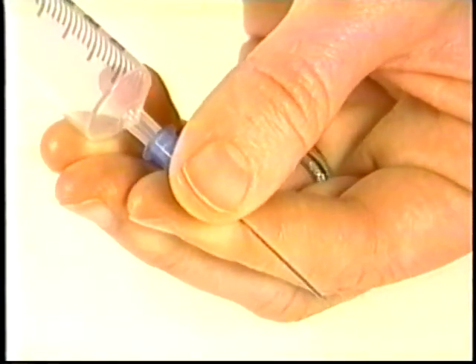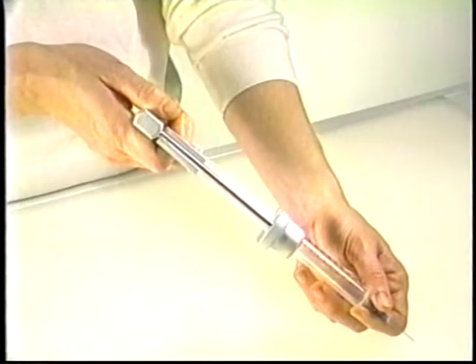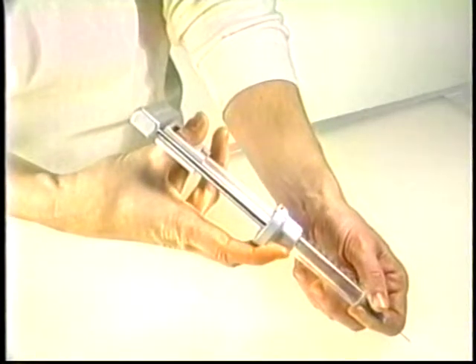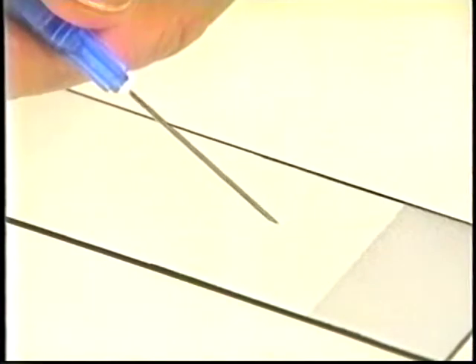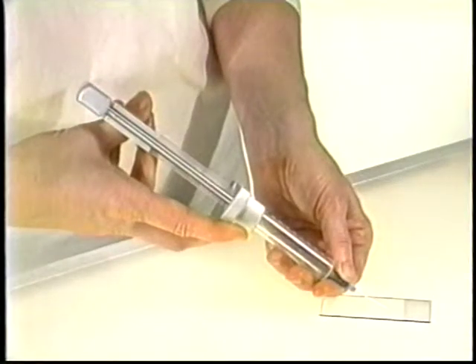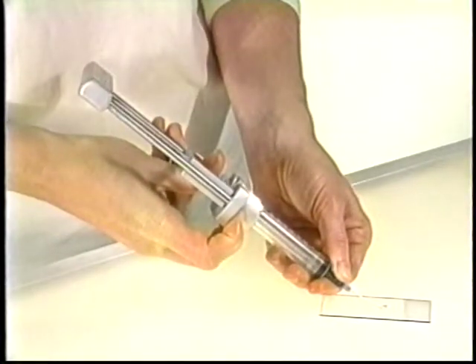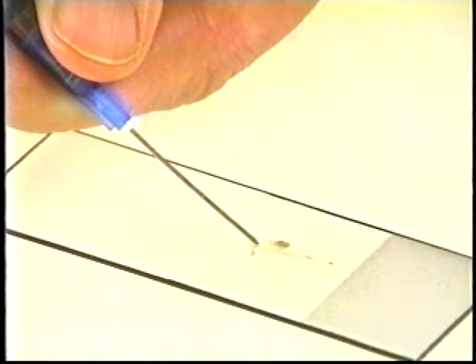Reattach the needle and change the grip on the syringe holder like this. Then position the needle tip in touch with the slide, bevel down, and expel the material with a forceful push on the plunger. This will result in expulsion of all the material on one slide.